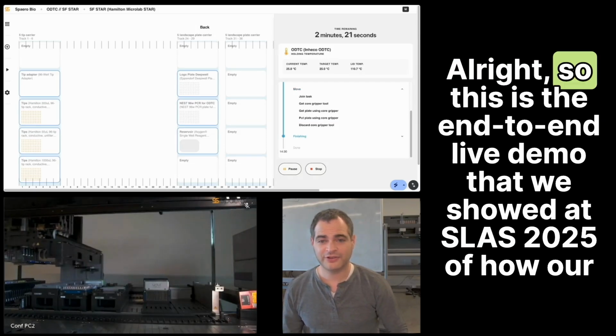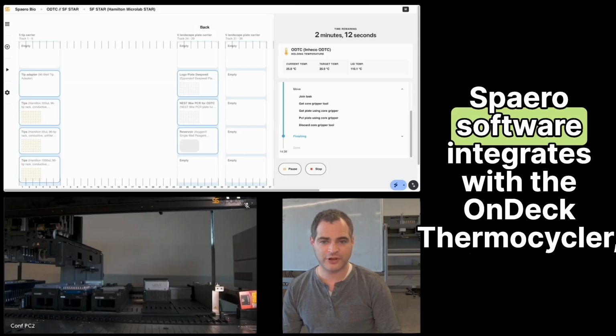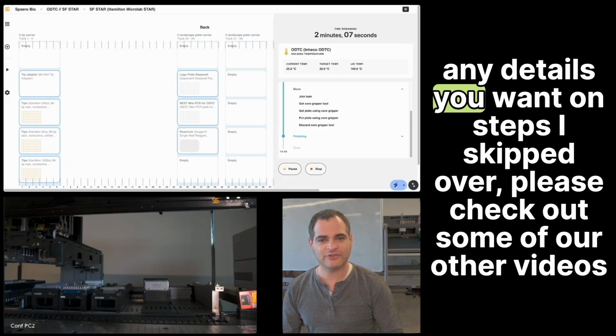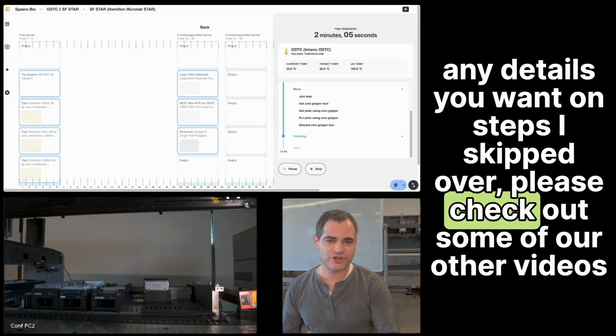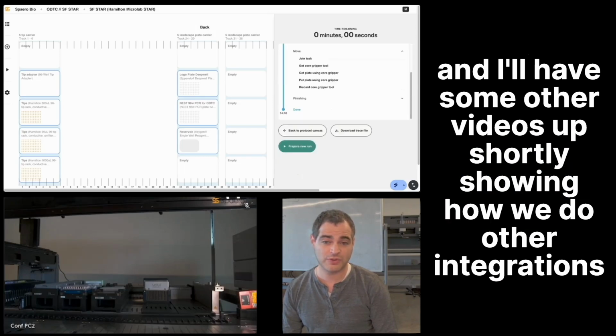All right, so this is the end-to-end live demo that we showed at SLAS 2025 of how our Spaero software integrates with the on-deck thermocycler instrument from Inheco. Any details you want on steps I skipped over, please check out some of our other videos, and I'll have some other videos up shortly showing how we do other integrations as well.